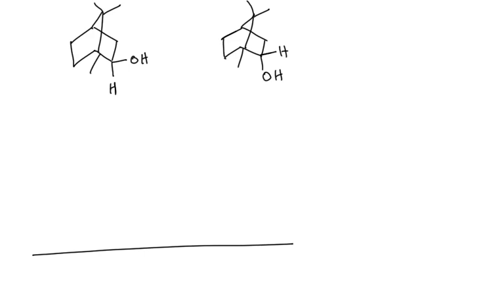Right, the isoborneol should be close to, I think, 3.5 or 3.6 ppm, right? 3.6 ppm. And look at the splitting pattern of this hydrogen. You have two hydrogens here, and there is no hydrogen on this carbon, and there is a hydrogen on the oxygen. The splitting pattern could be probably a triplet or a quartet.